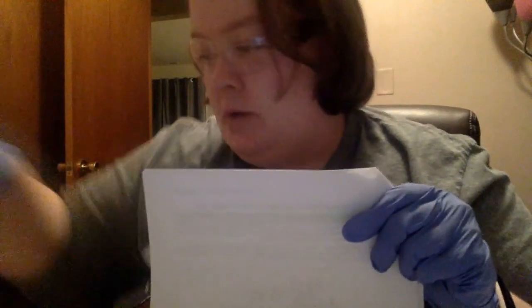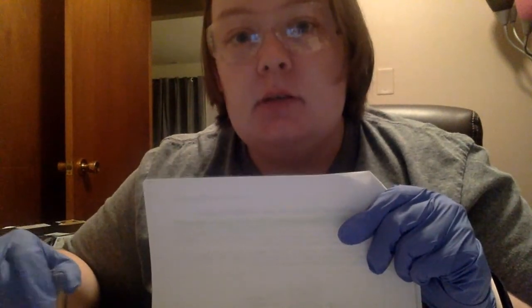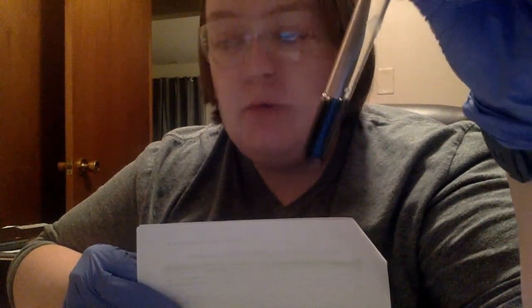Turn you back around to face me, and I'll show you what we collected using this white background. So, again, with gel filtration chromatography, what I was doing was separating our unknown waste product from the Acme plant, and our goal is to figure out if the ruffinotoxin is present here. We used gel filtration chromatography to separate the components by their molecular size, and when I did that, we got 3 different components.